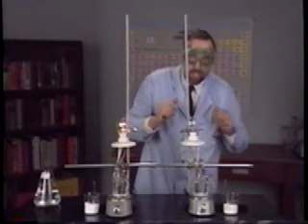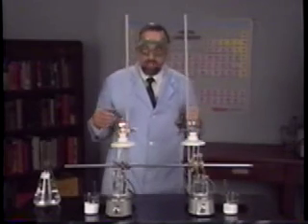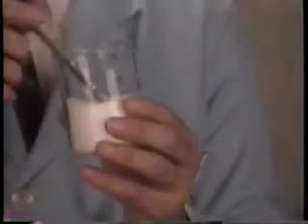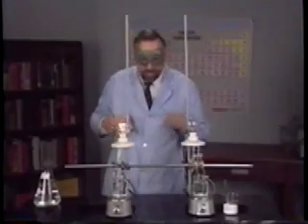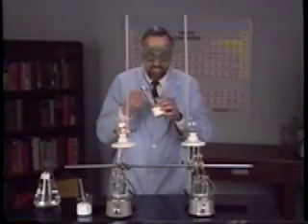It is a non-electrolyte. What do you think these two solids are? Solid number one was ordinary table salt, sodium chloride. And solid number two is ordinary sugar.